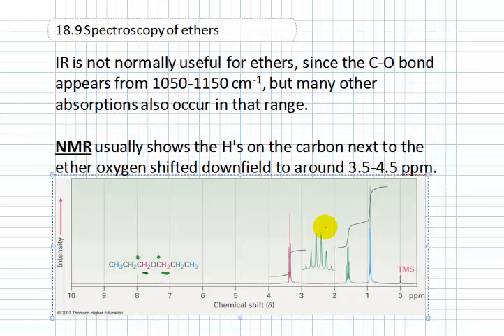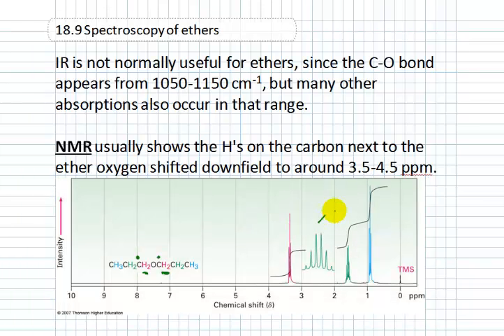This one here is just a blow-up of the one next to it. Mark that like that. But you should be able to look at the multiplicity of these peaks here. The CH2 that's furthest away has 2 hydrogens next to it, so that's a triplet. That's 2 hydrogens high, right? Its integral right there is 2 H's.